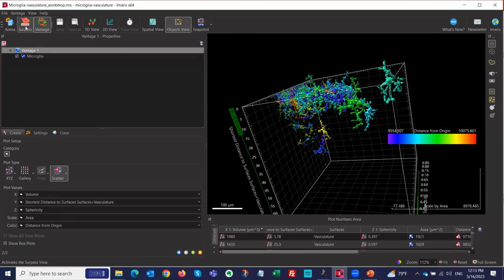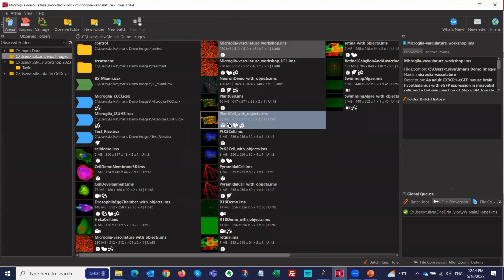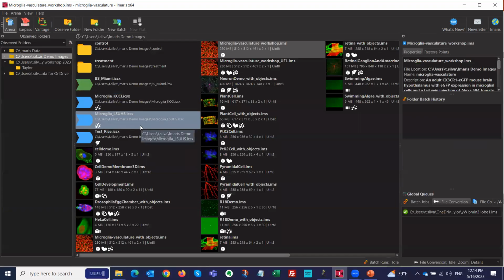Yeah, there's a lot you can do here, but the best way is to just go on and play with it. Okay, how are we on time? Good, good, good. So this basically concludes this data set. I want to move on to another data set. Any general questions about anything that you've seen? Anything unclear? Okay, awesome.